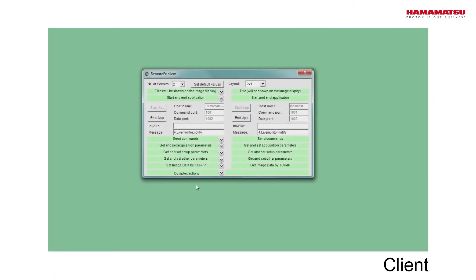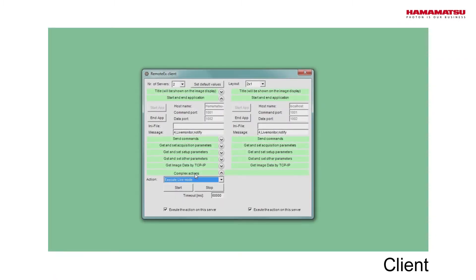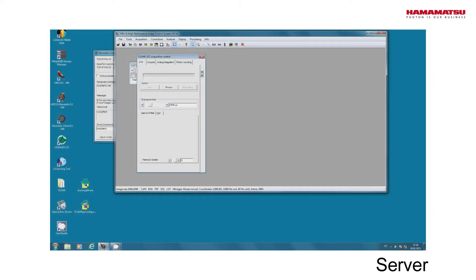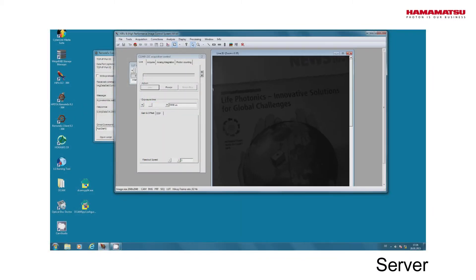Equally, we can start the Live mode at the application by selecting Execute Live Mode in the section Complex Actions and click to start.